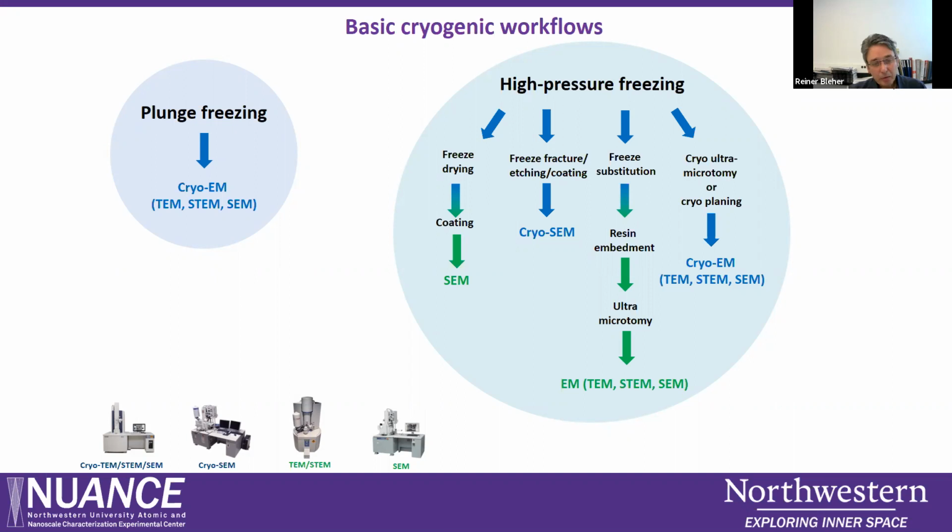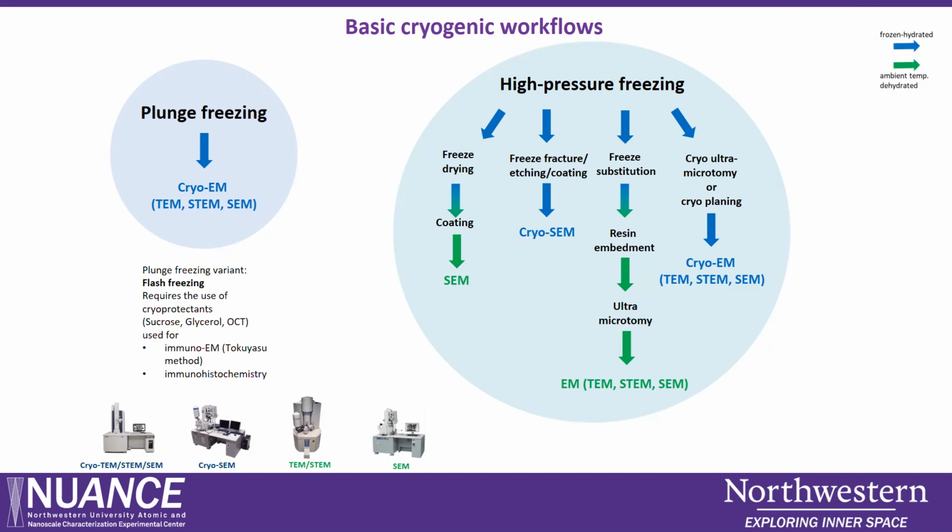And it's the method of choice for small samples in suspensions like molecules, virus particles, liposomes that can easily be prepared within these thickness limitations. There is, of course, overlap between methods, so we could freeze dry samples that were plunge frozen and study them at ambient temperature, for example. Also, we could use cryoprotectants and plunge or flash freeze thicker samples for particular applications.